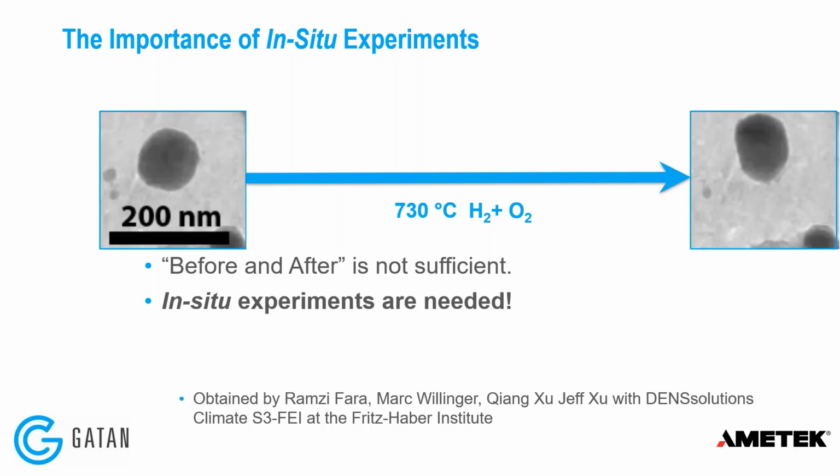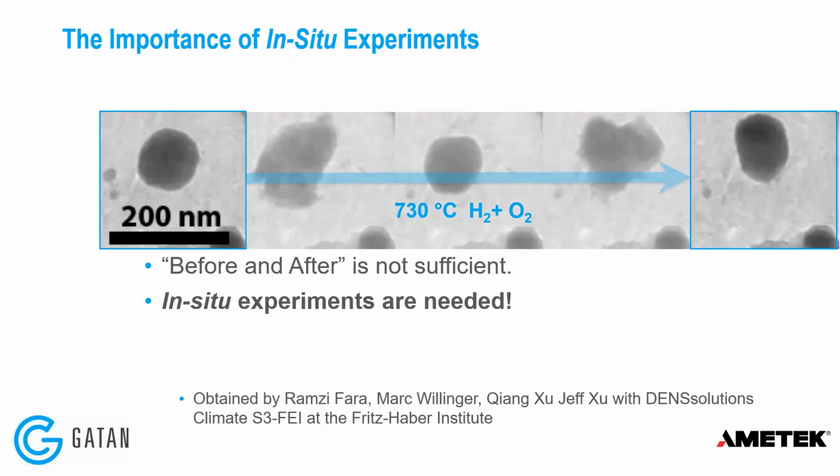And so you could go through a great deal of detailed analysis and looking at faceting and morphology and size of these particles. And I guarantee if you had not done an in-situ experiment, you would never, ever guess that this is actually what happened during the in-situ stimulus.